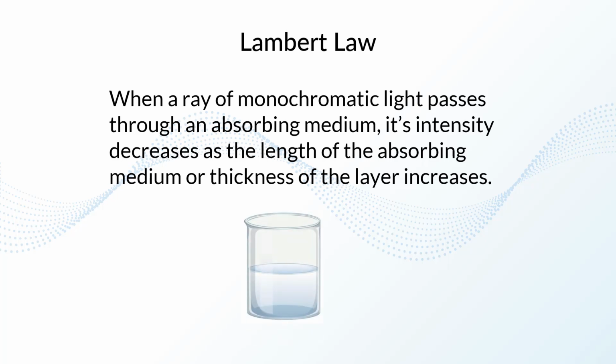If there is monochromatic light of intensity I0 and transmitted light IT, then what matters is the thickness of the system under investigation. So the amount of light absorbed depends upon the thickness of the medium, which is the concern of Lambert. Actually, this law is not that simple. There is some mathematical manipulation that we'll see later.